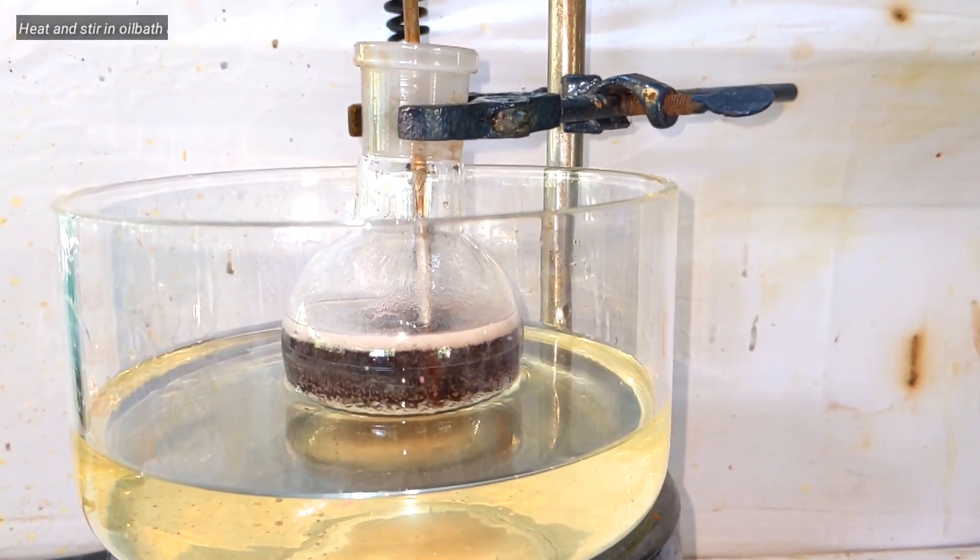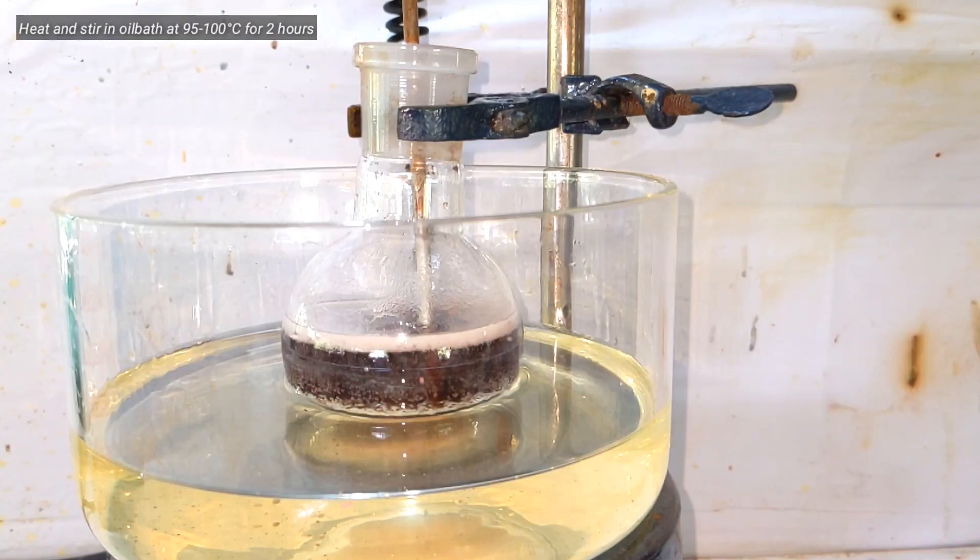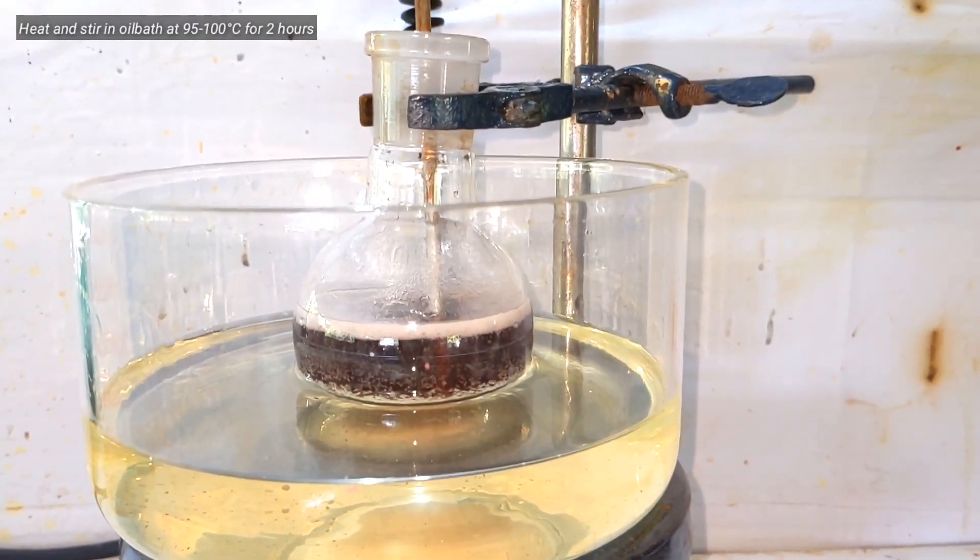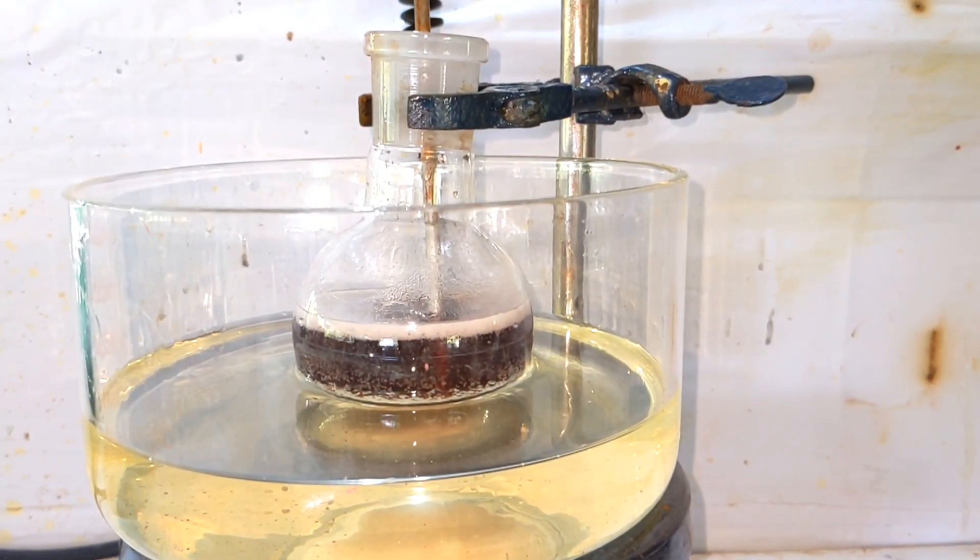Next we place the flask in an oil bath and then heat and continuously stir the flask at 95 to 100 degrees Celsius for 2 hours.